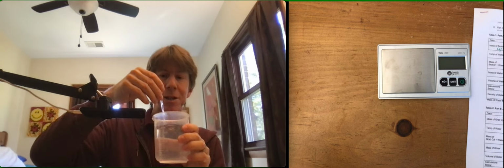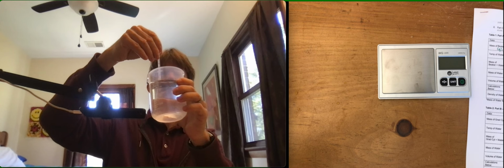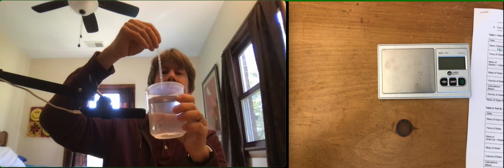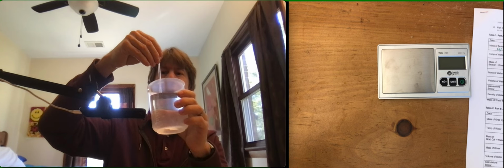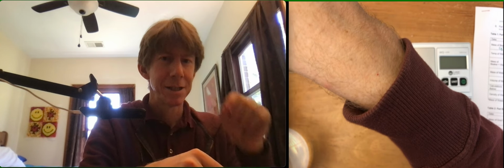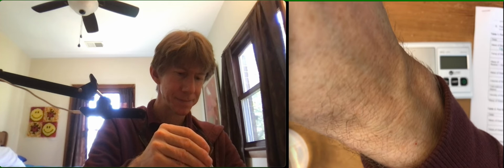And my favorite new way to do this, by the way, is to squeeze it out. Oop, I got an air bubble. So put it underneath the water, squeeze it, watch how high it rises up. It's not at 1. Squeeze it out, do some more air bubbles. Up, now I'm too high. Maybe this technique isn't going to work. All right, so now I'm just holding it exactly at 1 on the line, and I'm going over and putting it right in there. I guess my technique is squeeze it, suck it so it comes right up there while I'm still holding it right at that 1.00 level, and then put it on your scale.